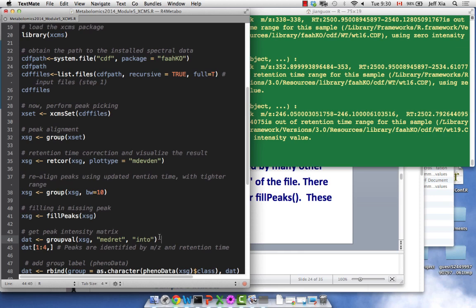All right. Okay. If you really want to see the plot, don't override it with the same XCMS object name, so you won't override. Because if you give the same name, it's gone, right? Yes, that's right.